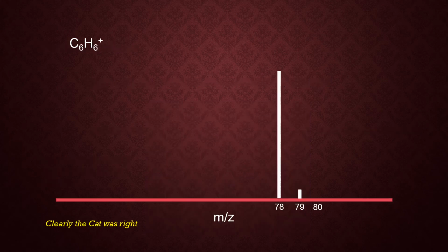And finally, here's a more extreme example, a larger, more significant real molecule that will really point out the issues when it comes to interpretation. If I have benzene, I have the expected peak at 78. I get the expected peak at 79 for the A+1 carbon. I've got nothing at A+2, but as I'm about to show you, that doesn't really mean anything. You have to be careful. So initially I would say there's nothing at A+2, no oxygen.